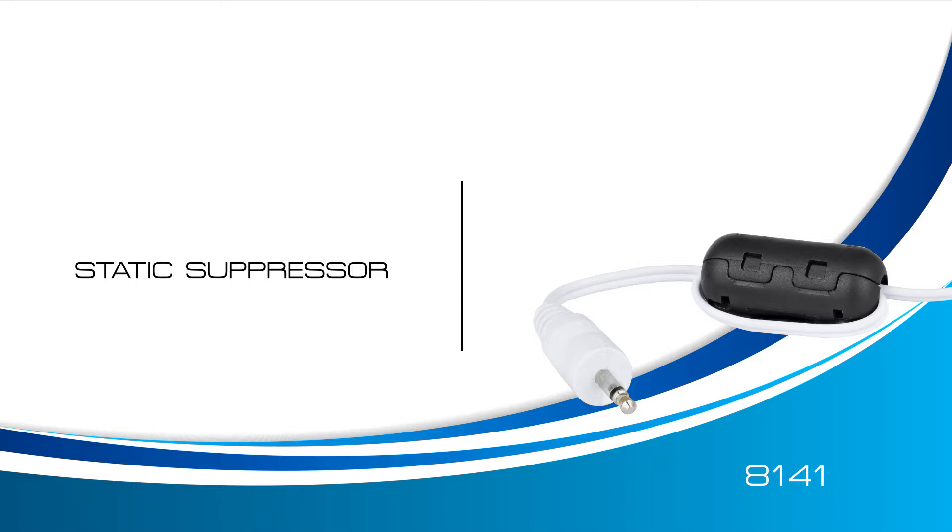It's highly recommended that you install a static suppressor on each of your temperature thermometers with cable probes. Without it, the static electricity generated by radio frequencies could affect the operation of your probe. With that in mind, let's learn how to install a static suppressor.